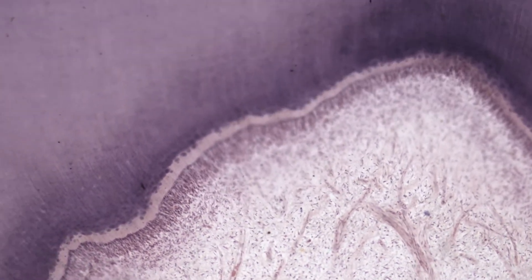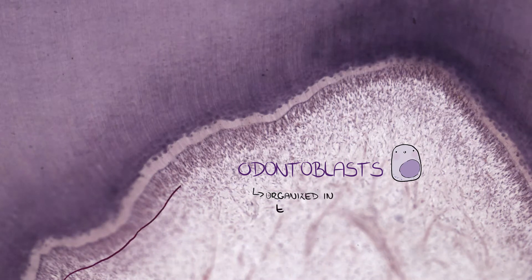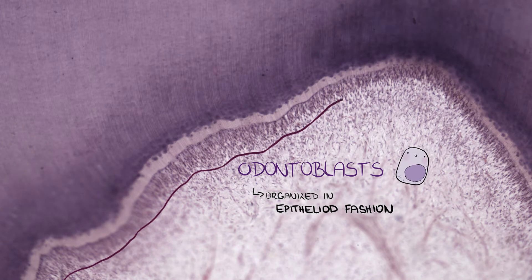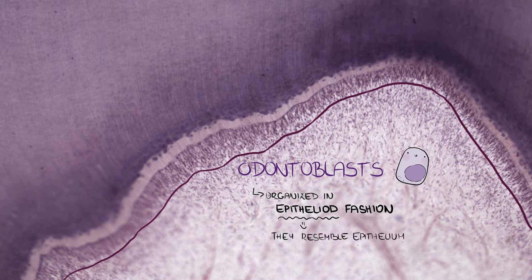Around the pulp there is a layer of cells called odontoblasts, organized in epithelioid fashion. This means that they resemble epithelium at first glance but are of mesenchymal origin.